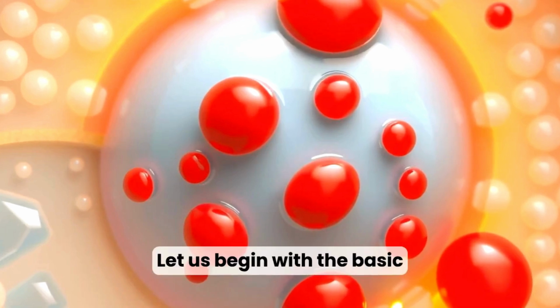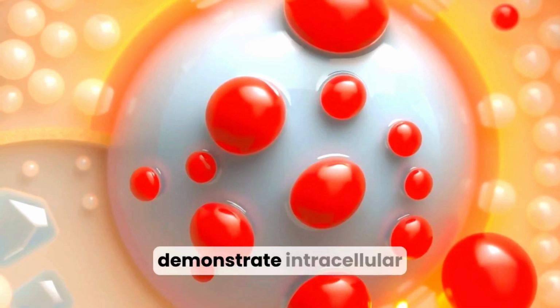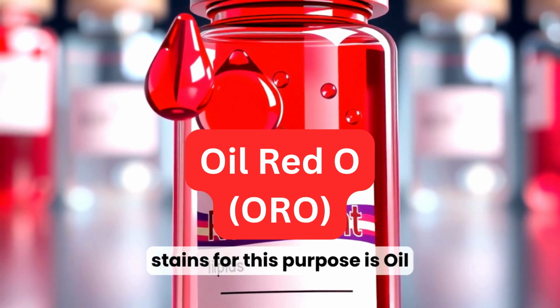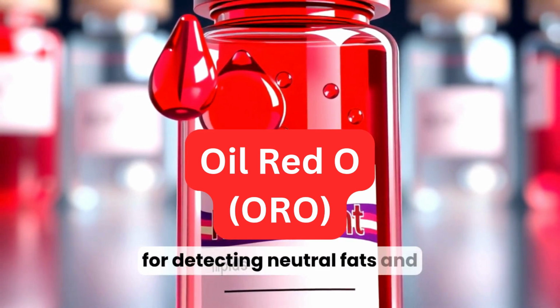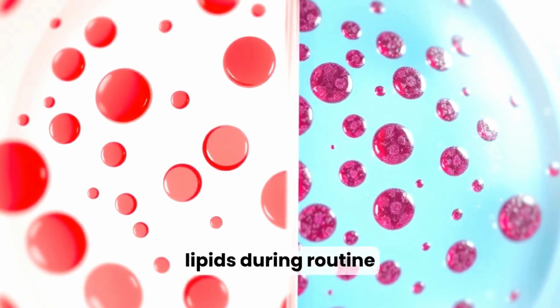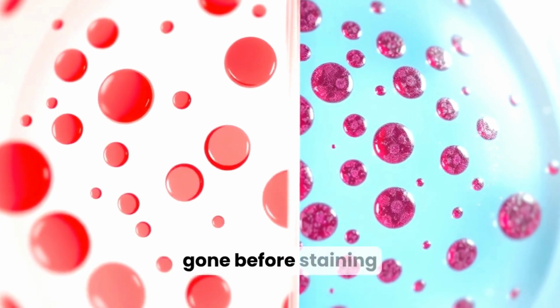Let us begin with the basic idea. Lipid staining is a specialized technique used to demonstrate intracellular lipids in tissue sections. One of the most commonly used stains for this purpose is oil red O, also known as ORO, useful for detecting neutral fats and fatty acids. Importantly, alcohol and clearing agents dissolve lipids during routine processing. If we used paraffin sections, the lipids would be gone before staining.